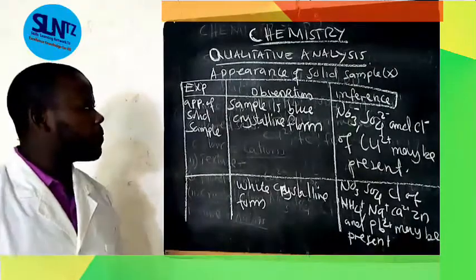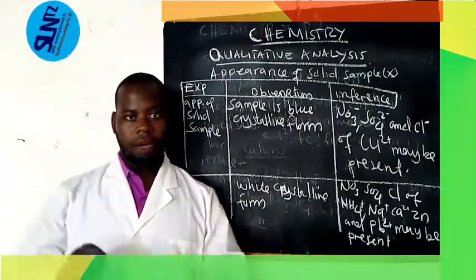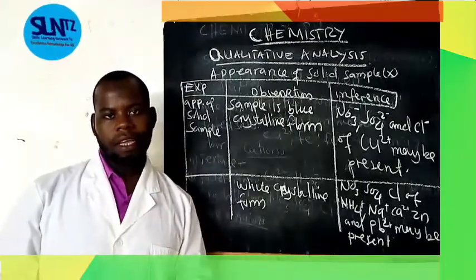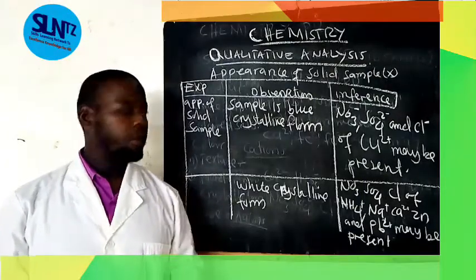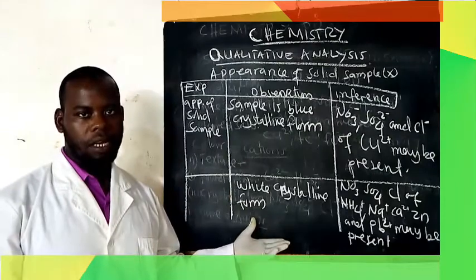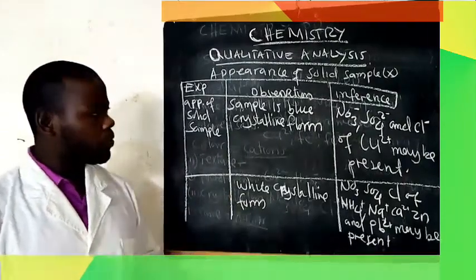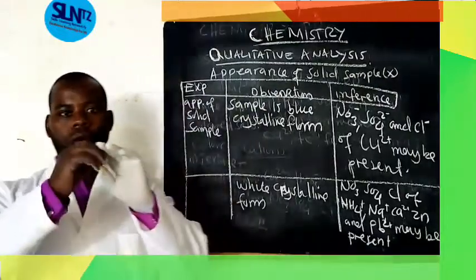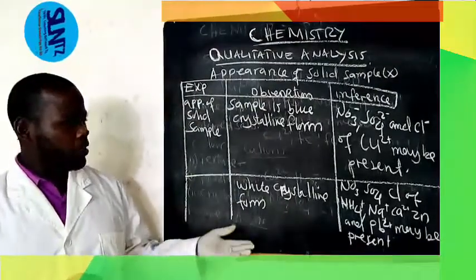But now, our lesson was to show you only the appearance of solid sample, how to identify cations, and how to write your report for this practical.